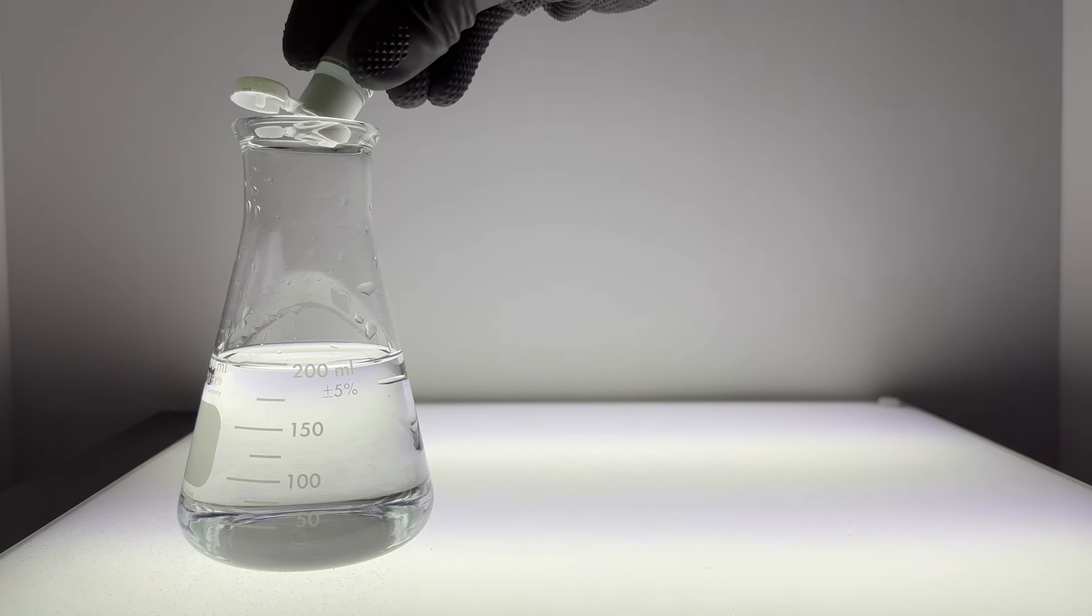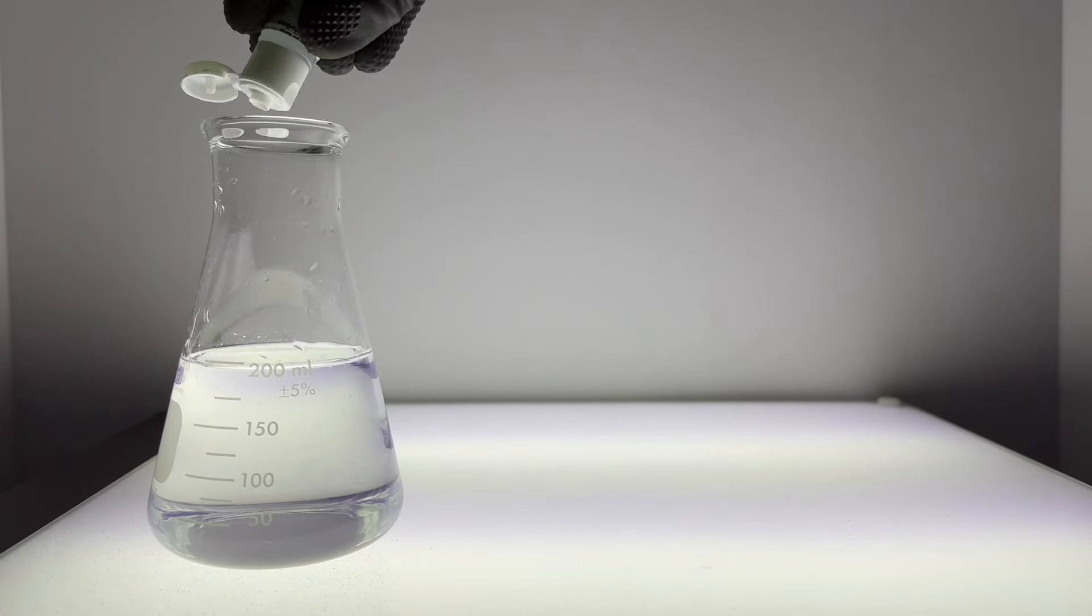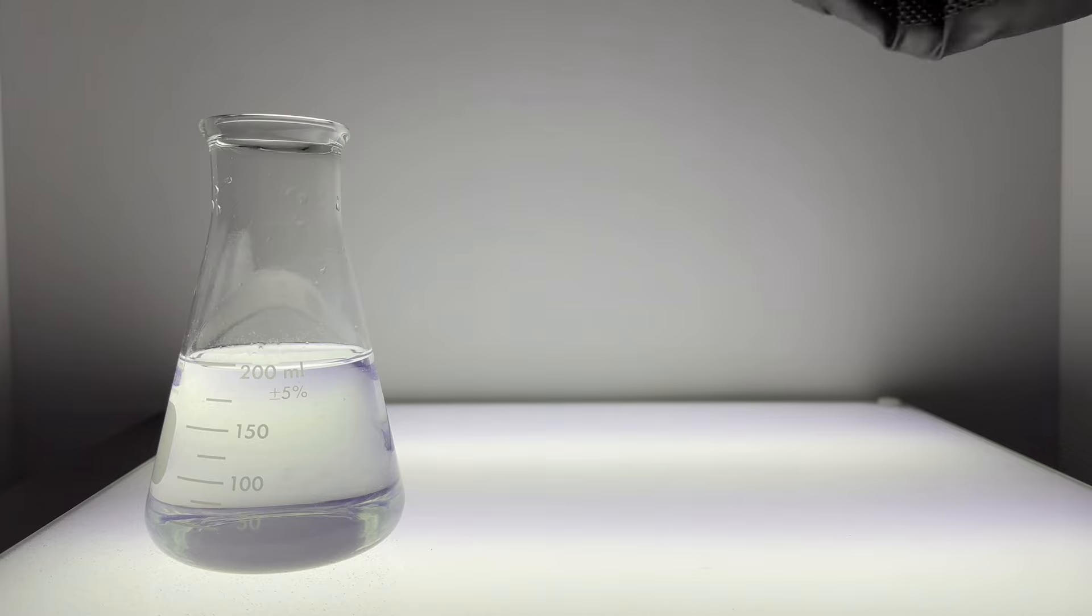For example, watch what happens when we add both phenolphthalein and thymolphthalein to this flask, and then add a little bit of base. Together, these two indicators generate a violet color.